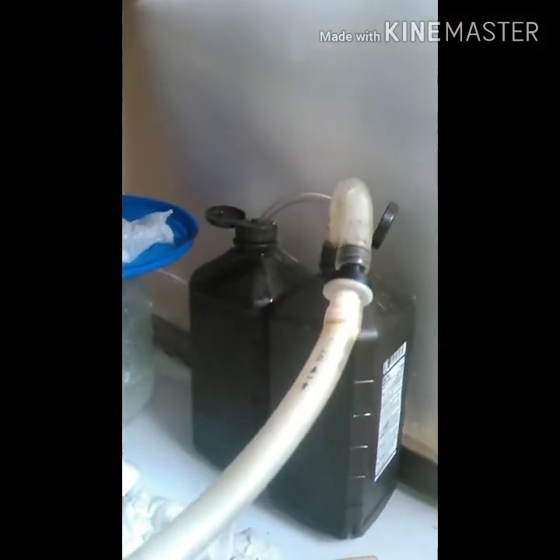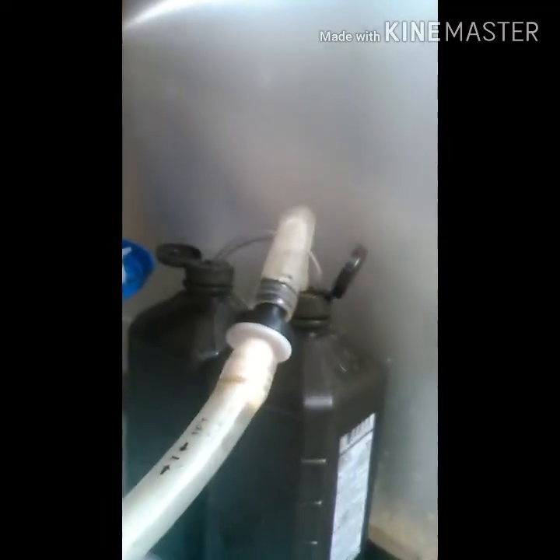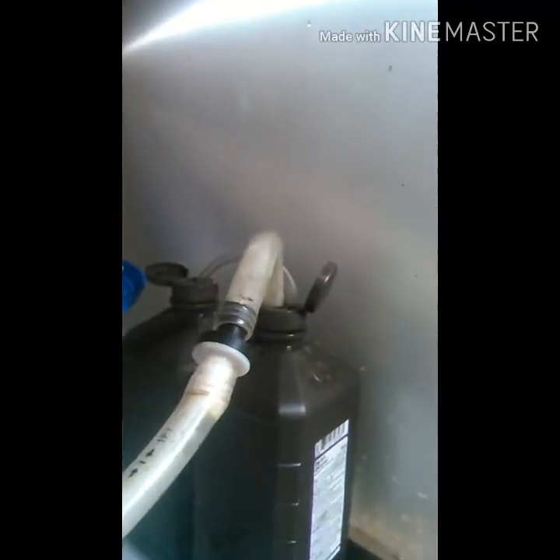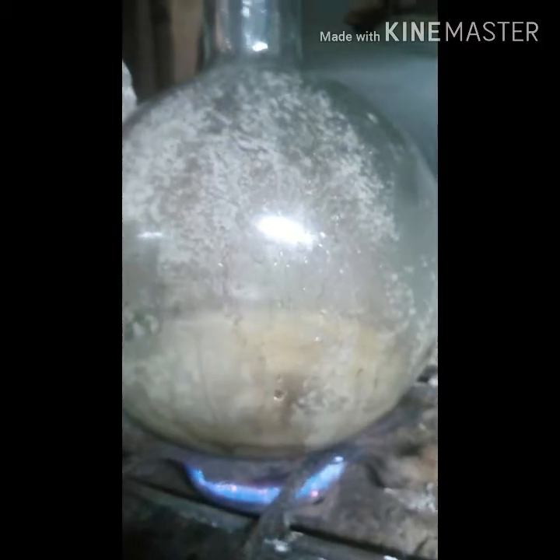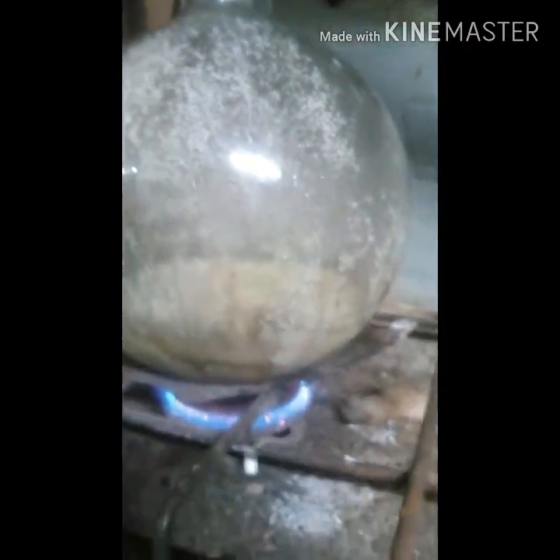You can hear it — it's just percolating away. Here's what this side looks like — it's kind of turned into like a cake batter consistency with foam on top.